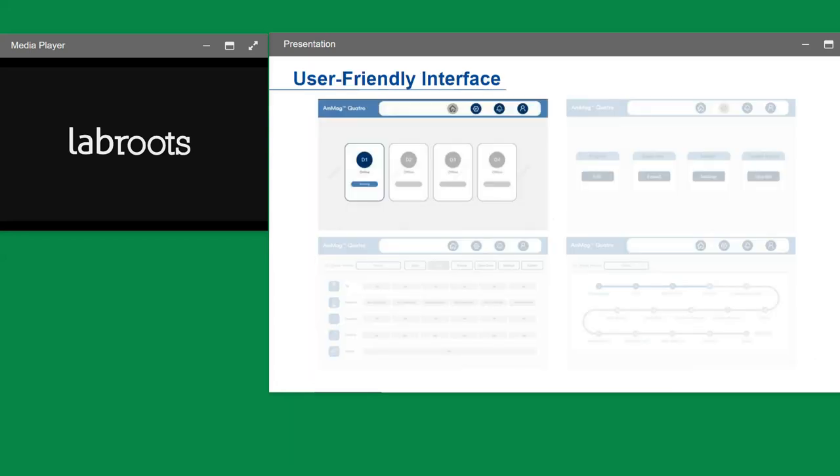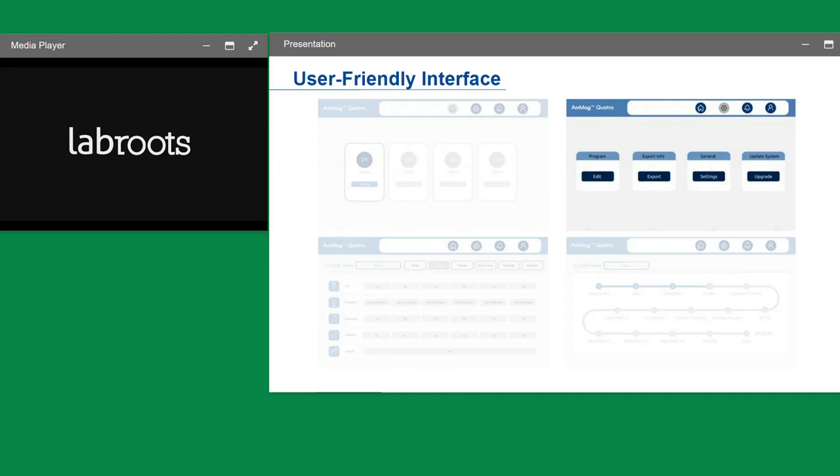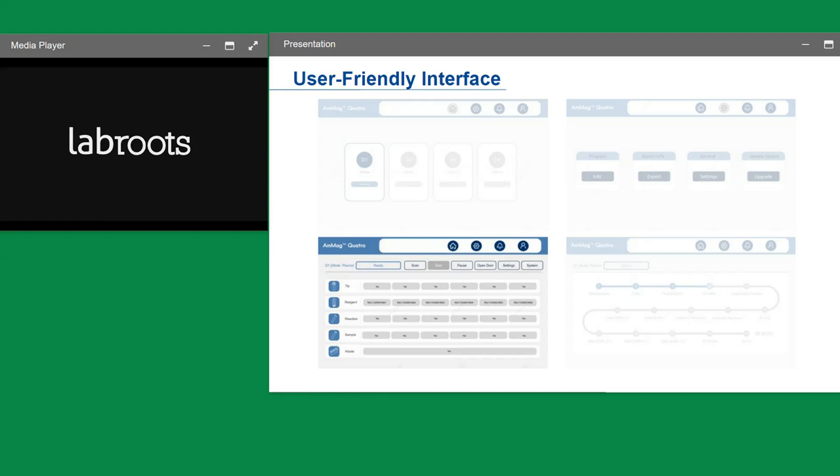The user interface shows the main controller screen, which can control up to four modules. In this example, only one module is online while the remaining modules are grayed out as offline. Within module number one, there are several settings available: programming, exporting previous run data, general settings, and system upgrades. This shows the different parameters the user will have control over.